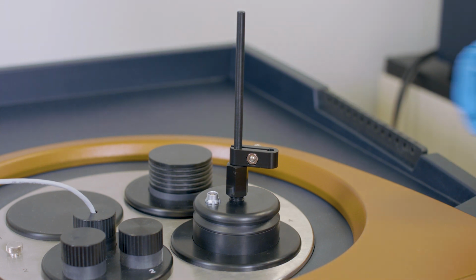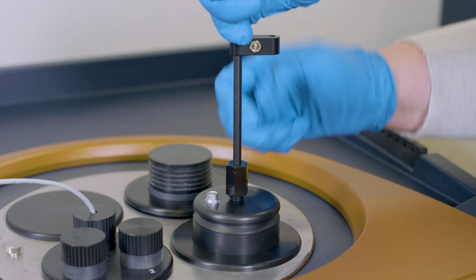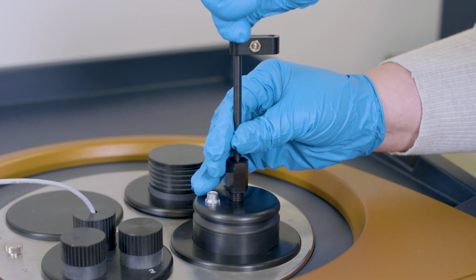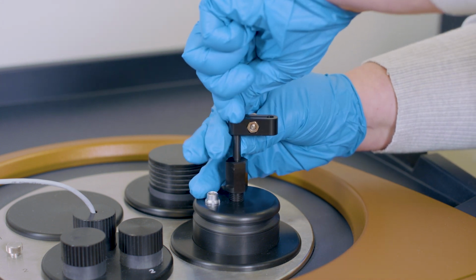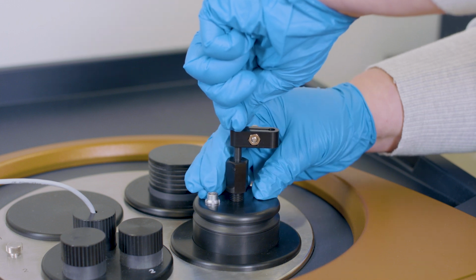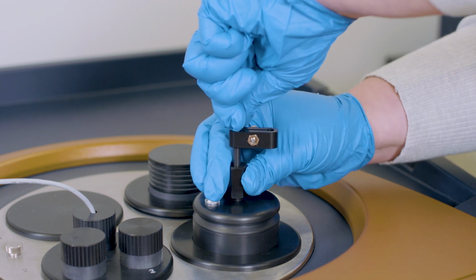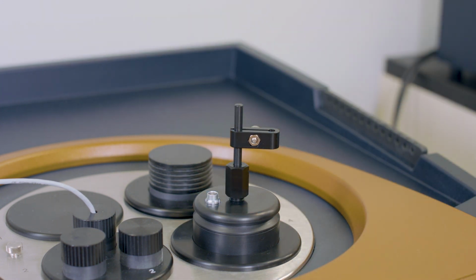To do this, loosen the clamp and the locking collar and lower the rod down. Do this carefully as you don't want the sample to drop down and damage the calorimeter. Once the sample is lowered all the way, you will feel a firm resistance. This is the lifter hitting the top of the sample holder. To avoid thermal contact, raise the rod around 4 to 6 millimeters and secure the locking collar.